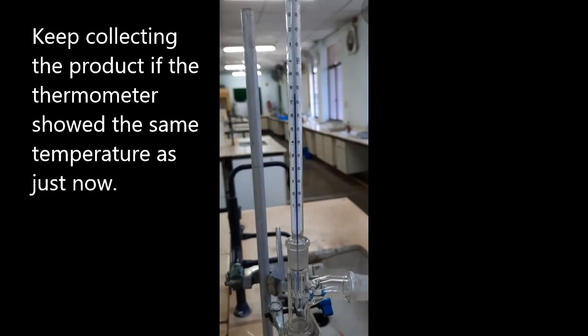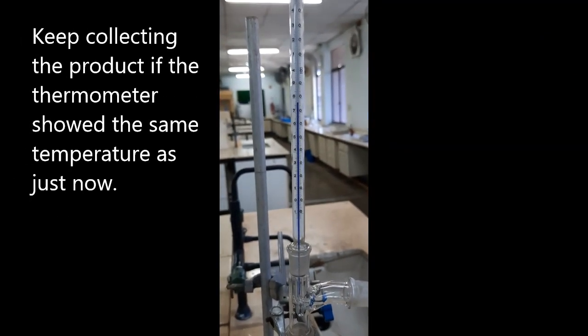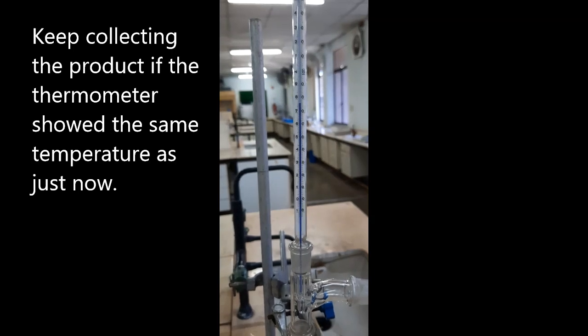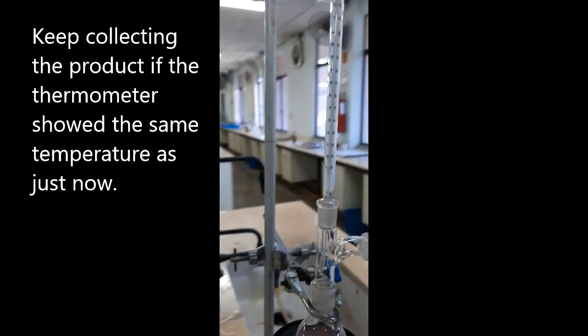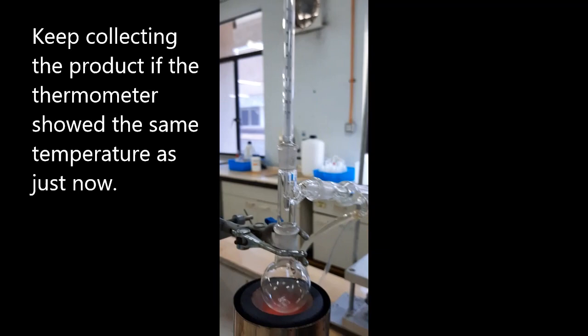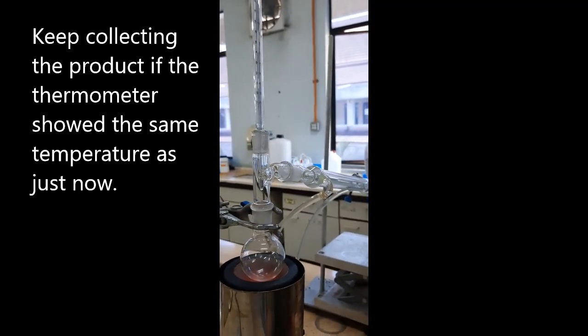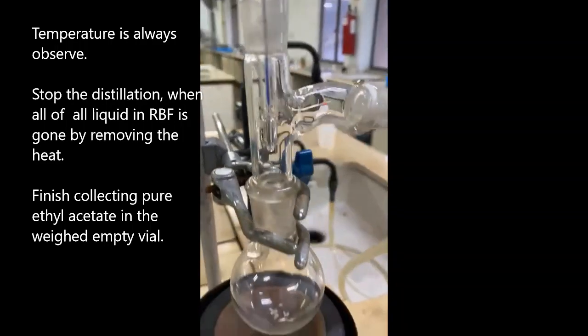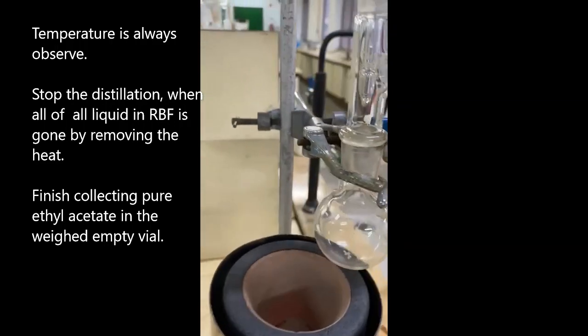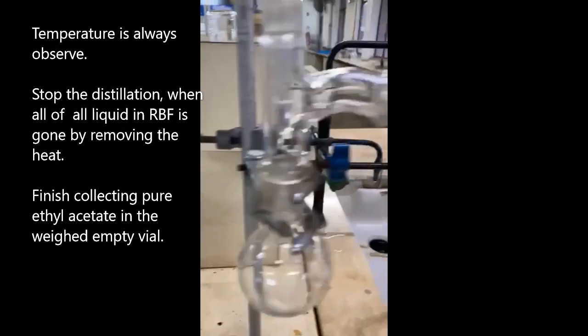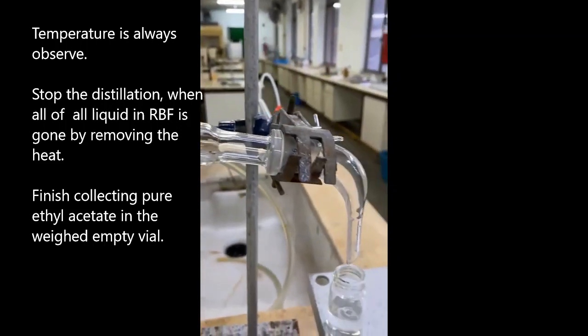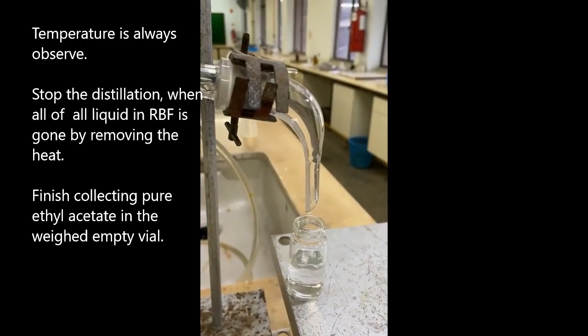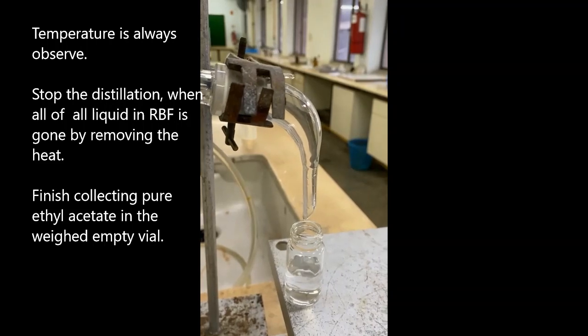Continue to collect the product, leaving the condenser at this constant temperature. Stop the distillation when the round bottom flask is empty. Make sure to collect all liquids leaving the condenser in the weighed vial.